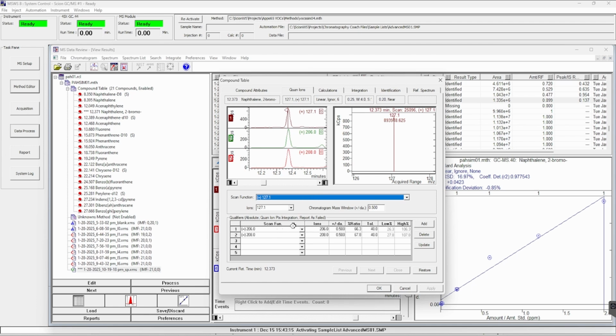The quant ions, we can then, if it's a Fullscan method, extract new ions or combine functions if we wish to sum our quantifier and qualifiers. We can also look at our tolerances. So if we're failing on our ratios, we may want to consider changing our tolerances. Or we may wish to make them tighter if a regulation defines that this must be the case.